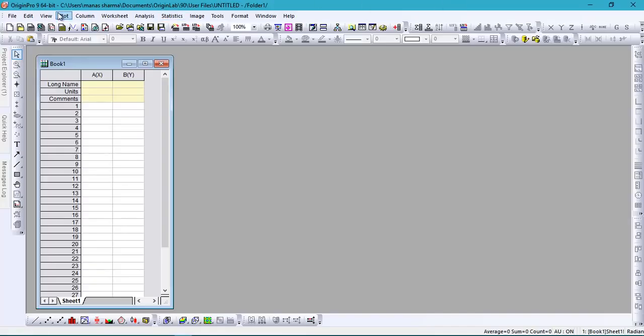Another thing to know is that I don't think Origin versions earlier than 8 or 8.5 can do this. I have Origin 9, but just make sure that you get a recent version, because I'm not sure if versions before 8.5 could do that. I mean, they do have a wizard that performs a fit, but I'm not really sure how well that works. Okay, so enough with the chit chat, and now let's begin to calculate the FWHM for my XRD pattern.